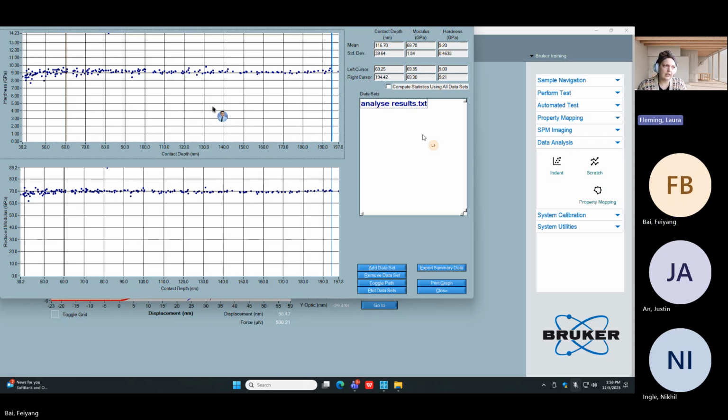The machine compliance calculates the compliance of the entire system. So, let's see, the table to the floor, the table to the feet, the feet to the next feet, and so on and so forth, up to the feet to the granite to the XY stage, to the sample stage, to the sample, to the mounting, and on the Z, right, it goes up and over, the Z granite to the XY granite to the Z stage to the dovetails to the scanner to the transducer. All of that compliance, meaning whatever compliance is in that system, is what we're looking for.